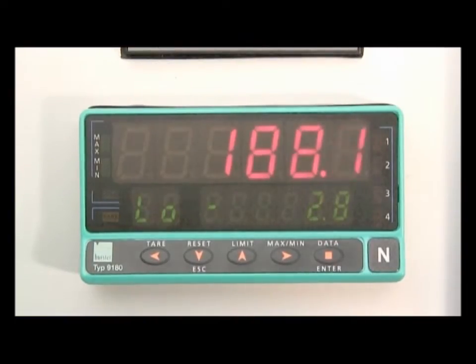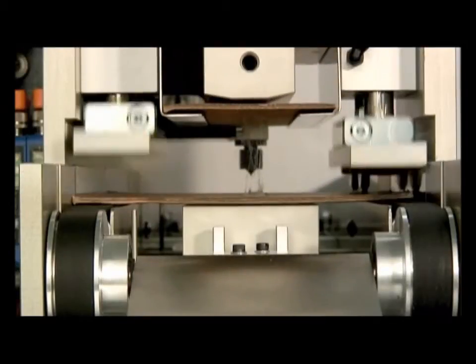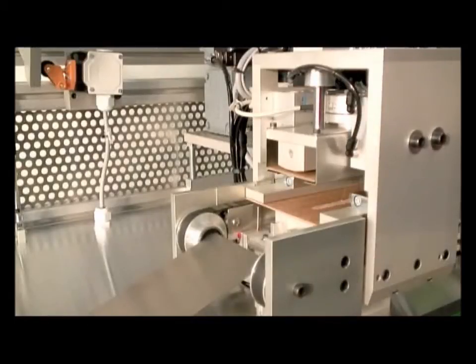In test series, the highest measured tensile force evinces the limiting values concerning open time and setting time.